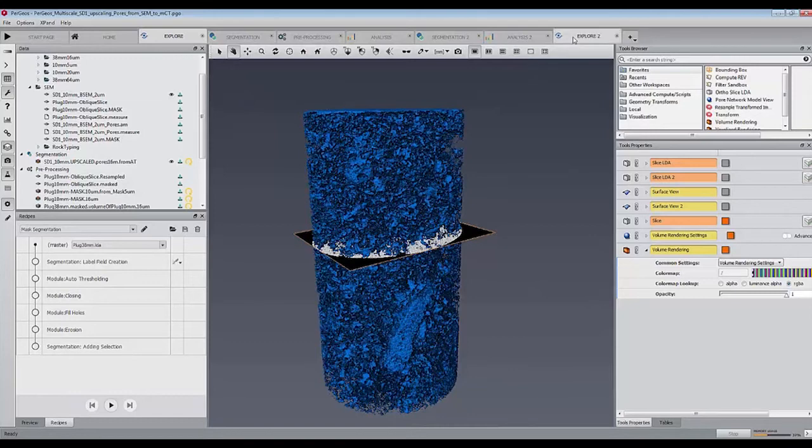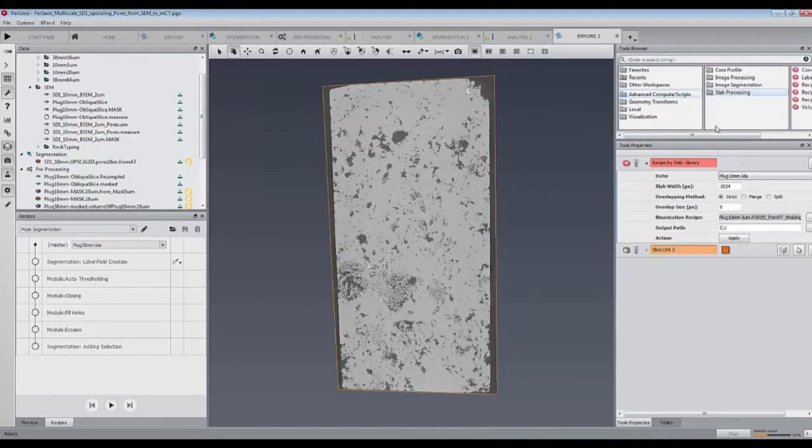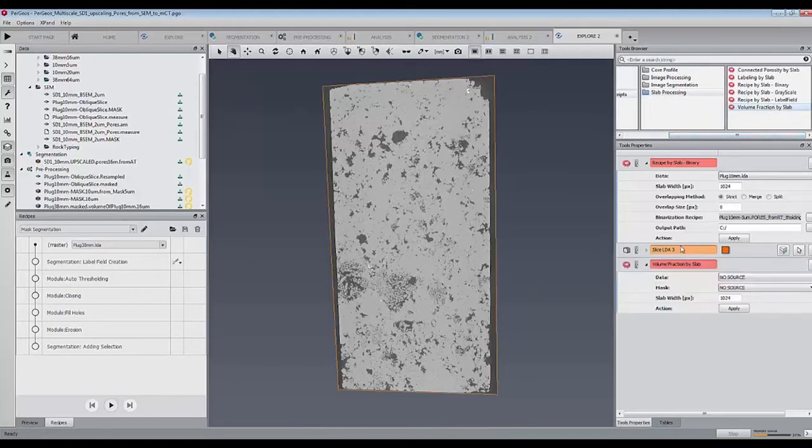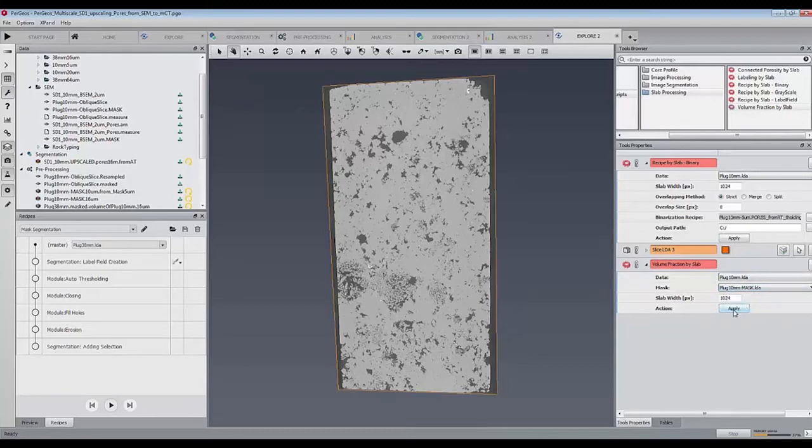A volume fraction by slab module, indicating the mask as second input, will give us a value of around 15%, which is close to the value of 14.7% obtained in the laboratory.